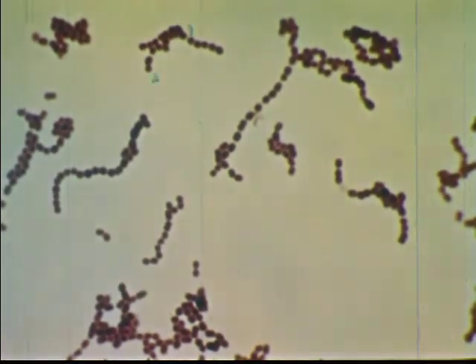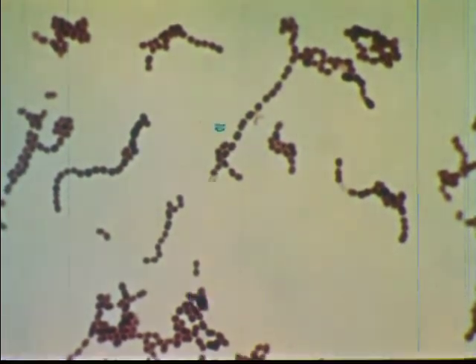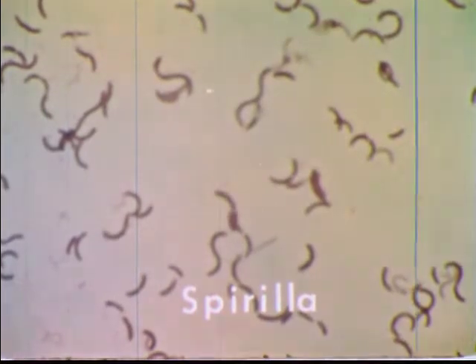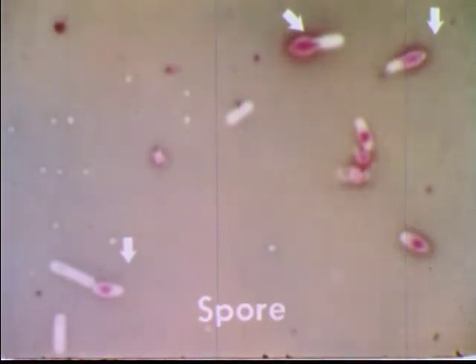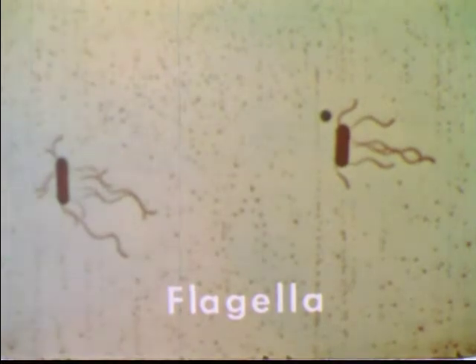Samples from other colonies show the presence of cocci, which are spherical in shape. Those with spiral shapes, the spirilla, are less frequently found. In certain studies, special stains may be used to reveal important structures — for example, the spore produced by some bacteria, which permits survival during unfavorable conditions. Another staining procedure reveals flagella, long whip-like structures which enable bacteria to move in a liquid.